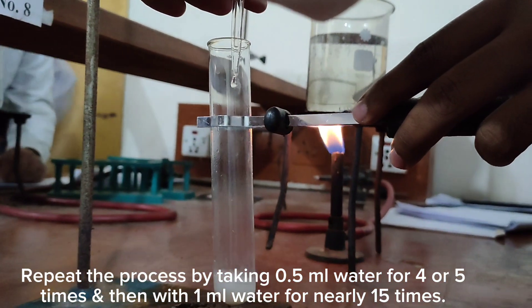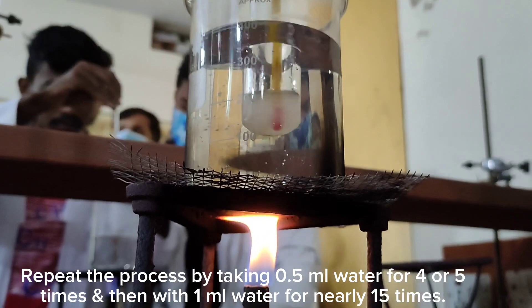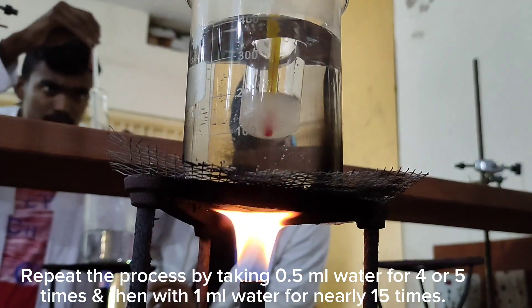Repeat the process by taking 0.5 milliliter water for 4 or 5 times, and then with 1 milliliter water for nearly 15 times.